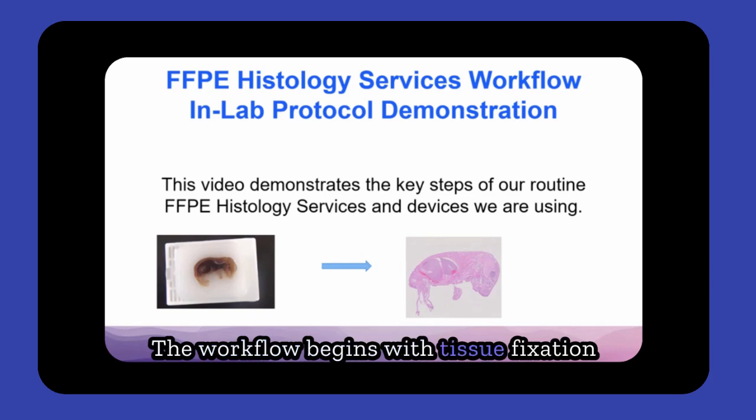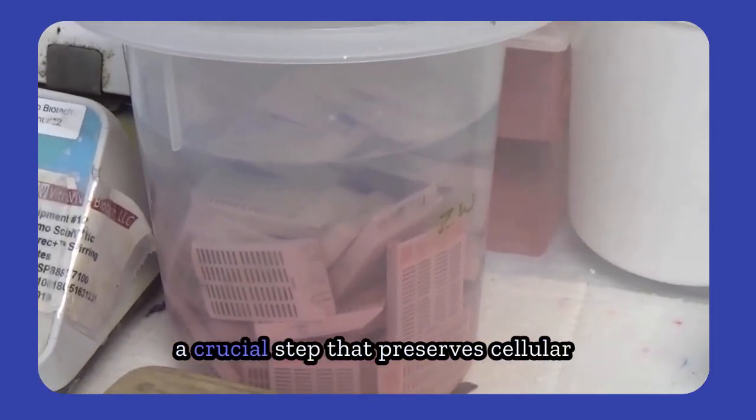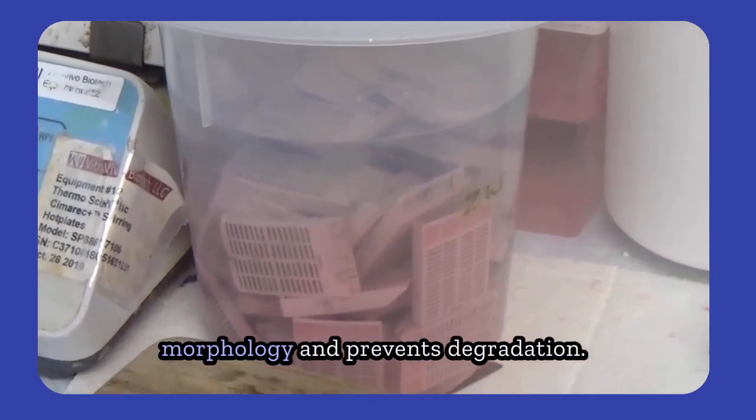The workflow begins with tissue fixation in 10% neutral-buffered formalin, a crucial step that preserves cellular morphology and prevents degradation.